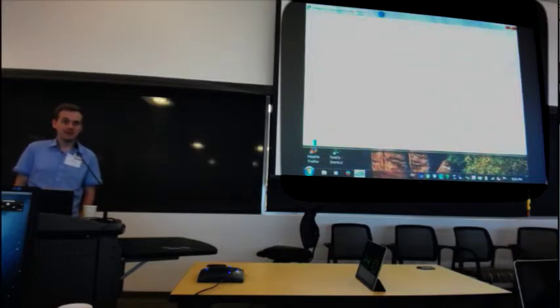Waiting for the dark cal to finish. Everyone wants to access the same file. Everybody's batch jobs are all ready. Just waiting for them to complete.